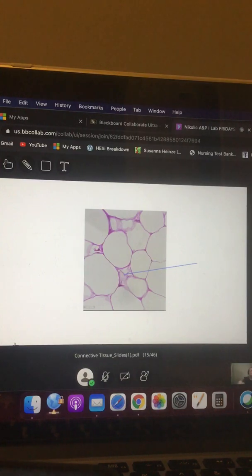Go ahead, Gloria. So in our lab book on page 44, where they have the adipose connective tissue, at the very top of the picture, there's like a little pink area. Is that ground substance? That is correct. So you can notice that nothing takes up a stain except that area. Awesome. Good job. All right. We really want you to notice just the things that you need to.